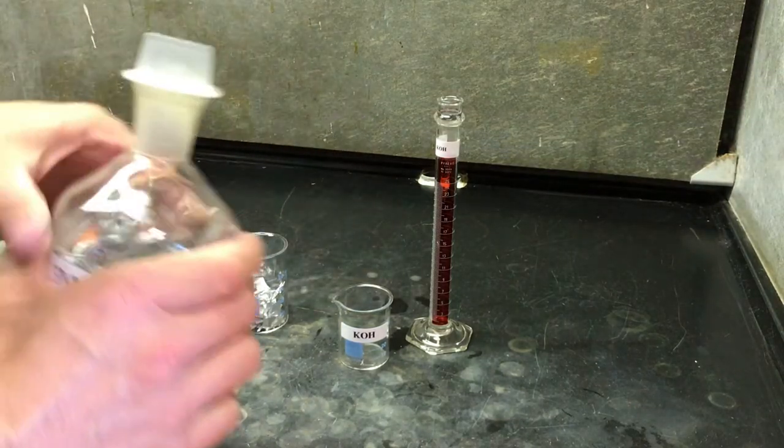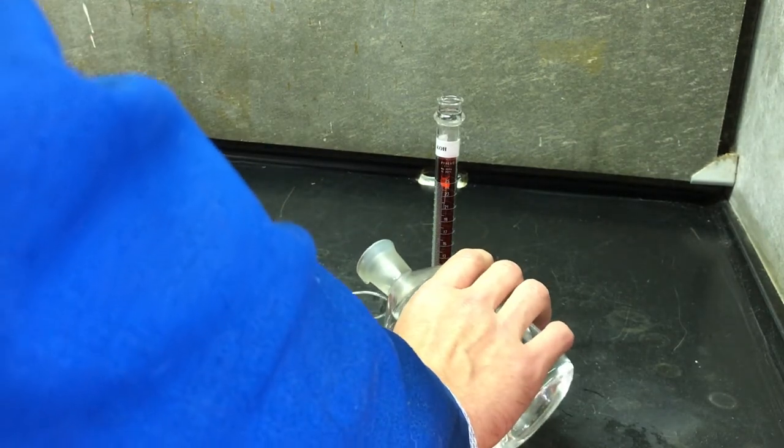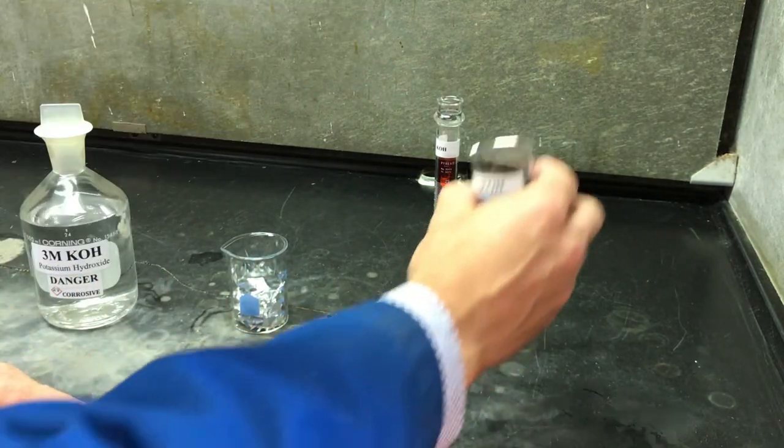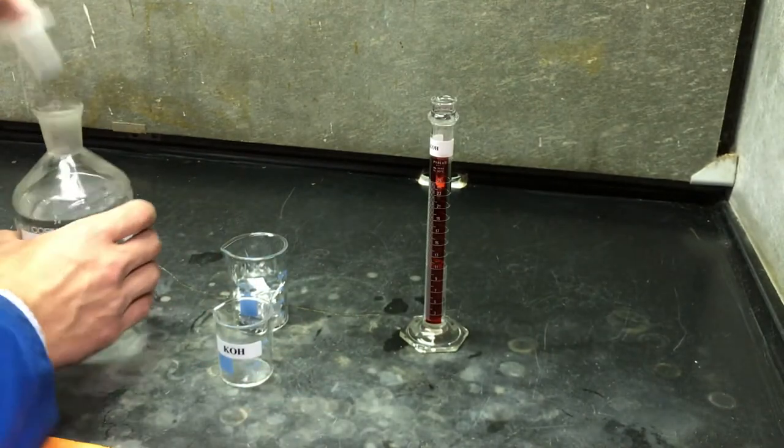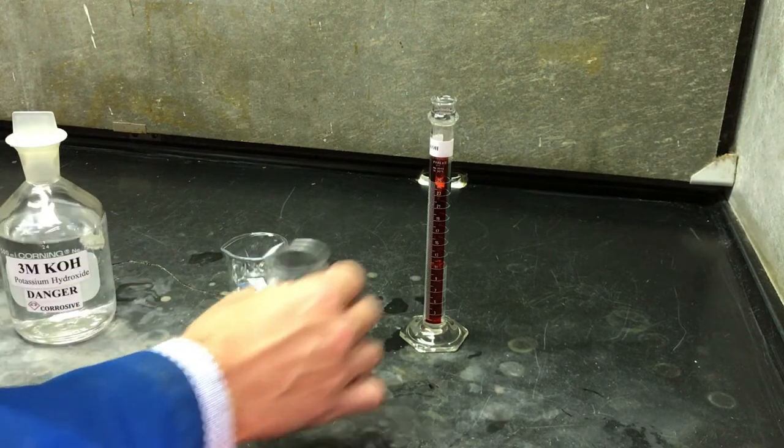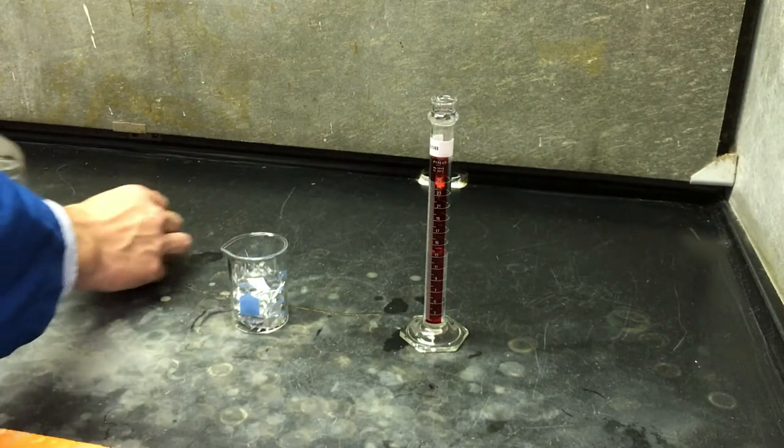We'll use 3 molar potassium hydroxide to ionize our metal. KOH is caustic, extreme care should be exercised. We'll target 13.0 mils, plus or minus 0.5 mils. When working with such a caustic chemical, it's best practice to use a secondary transfer vessel such as a beaker to eliminate undue risk. Here we've measured 13.0 mils.